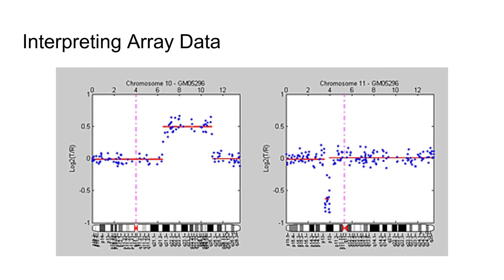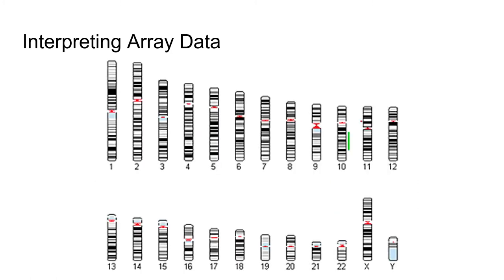We can also zoom in on each chromosome for a better look. The pink dotted line indicates the centromere. Chromosome 10, Q arm, shows a gain of genetic material, whereas chromosome 11 shows a loss of genetic material within the P arm. This can also be reported on a karyogram as bars adjacent to the chromosome — green for gain and red for loss.